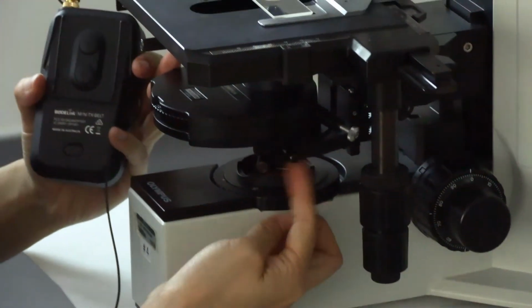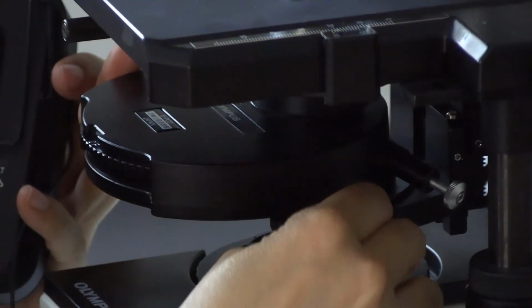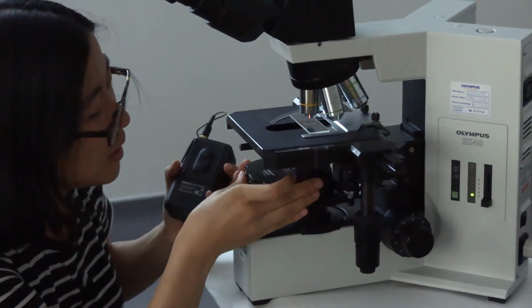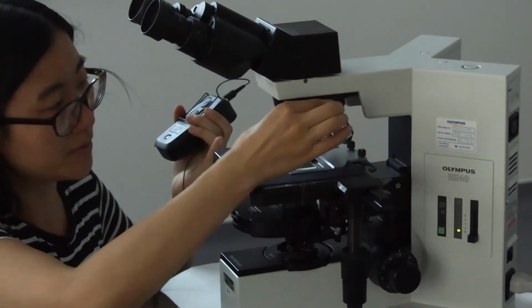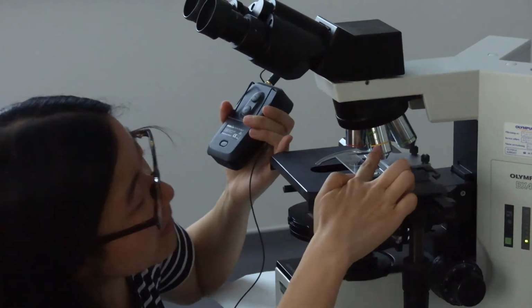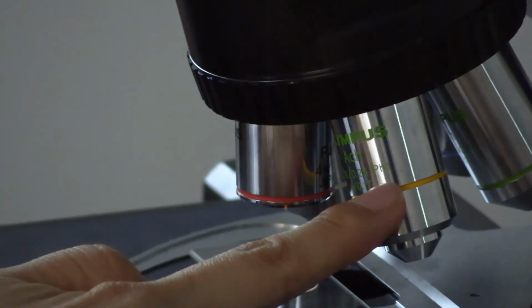And then we will use this small screw to tighten it. So the important thing is when you try to use, for example, the objectives. For example, this one, the 10 times objective, you can see that there's a marker, pH1.